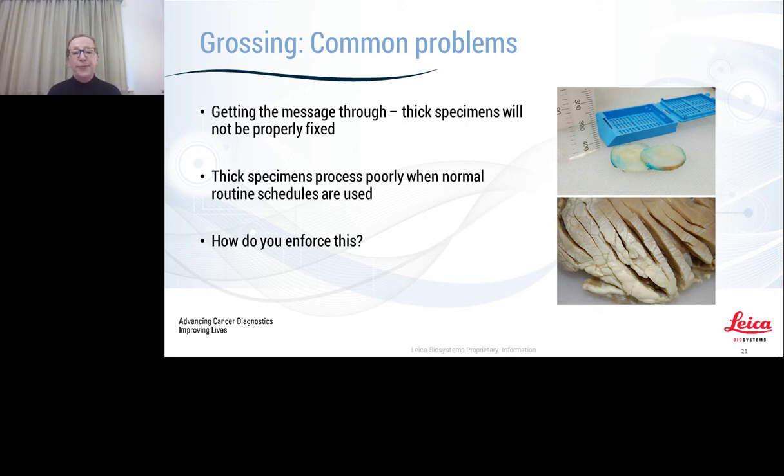So moving on to grossing. So getting the message through, thick specimens will not be properly fixed. Thick specimens process poorly when normal routine schedules are used. So how do you enforce this? On the right, you can see some images.